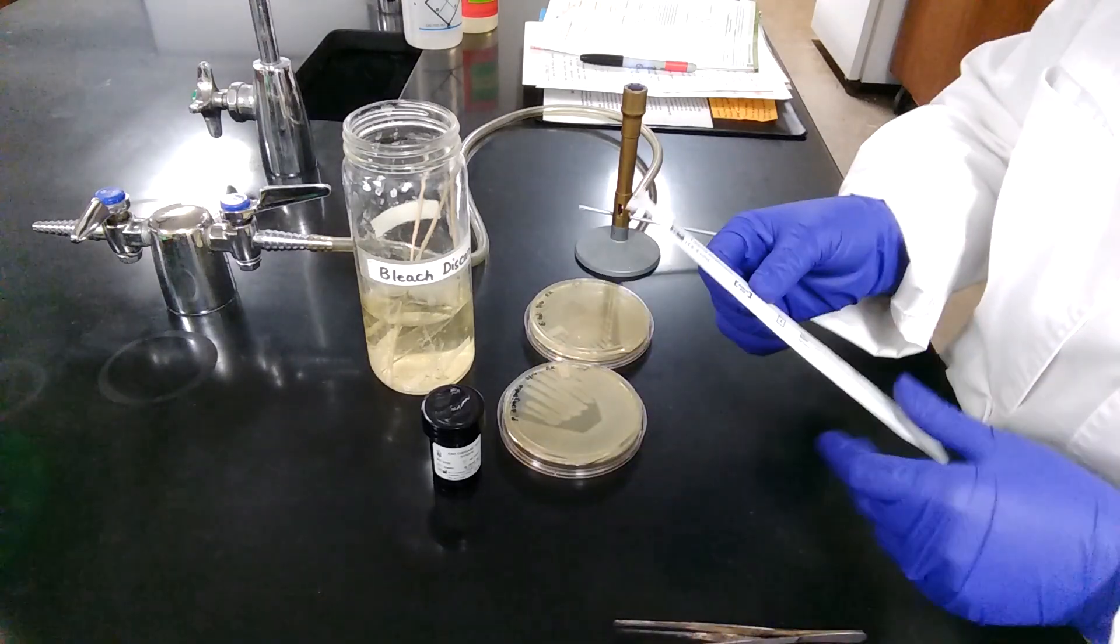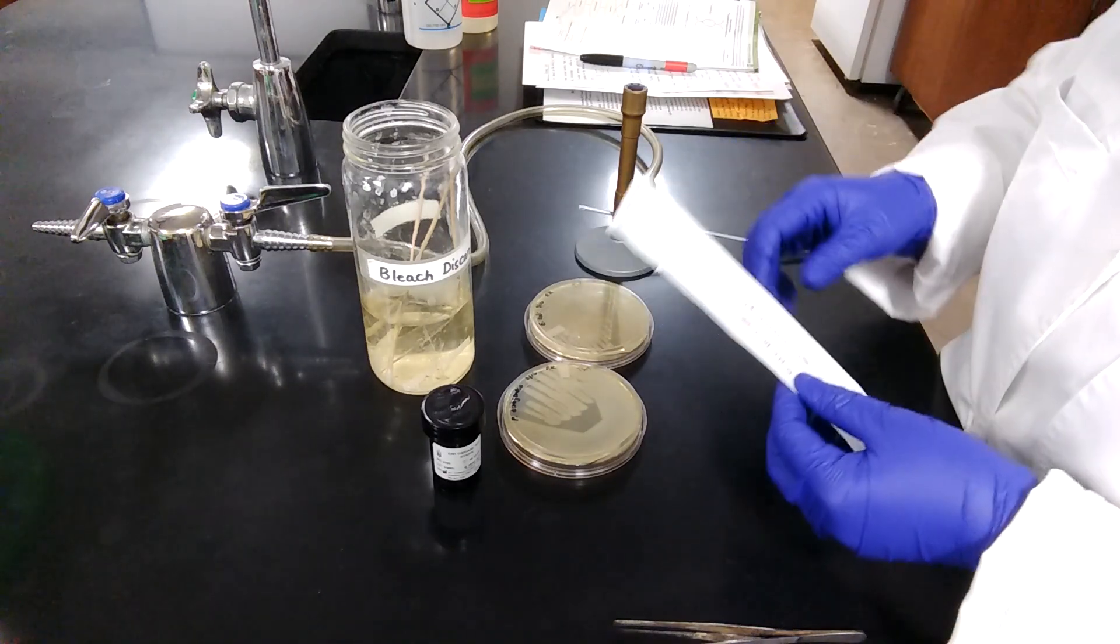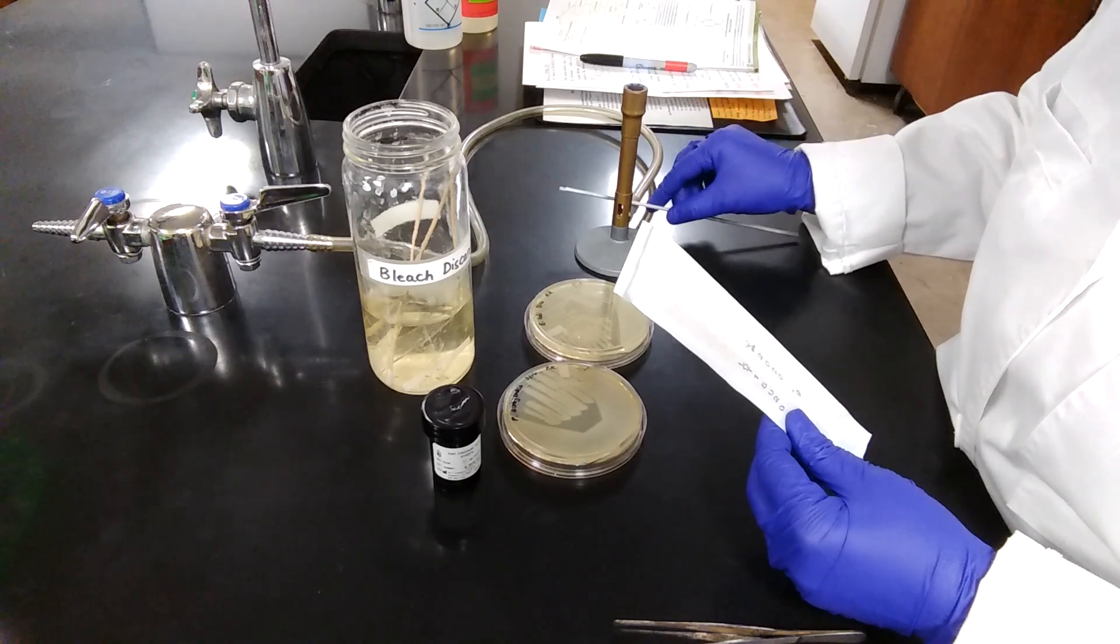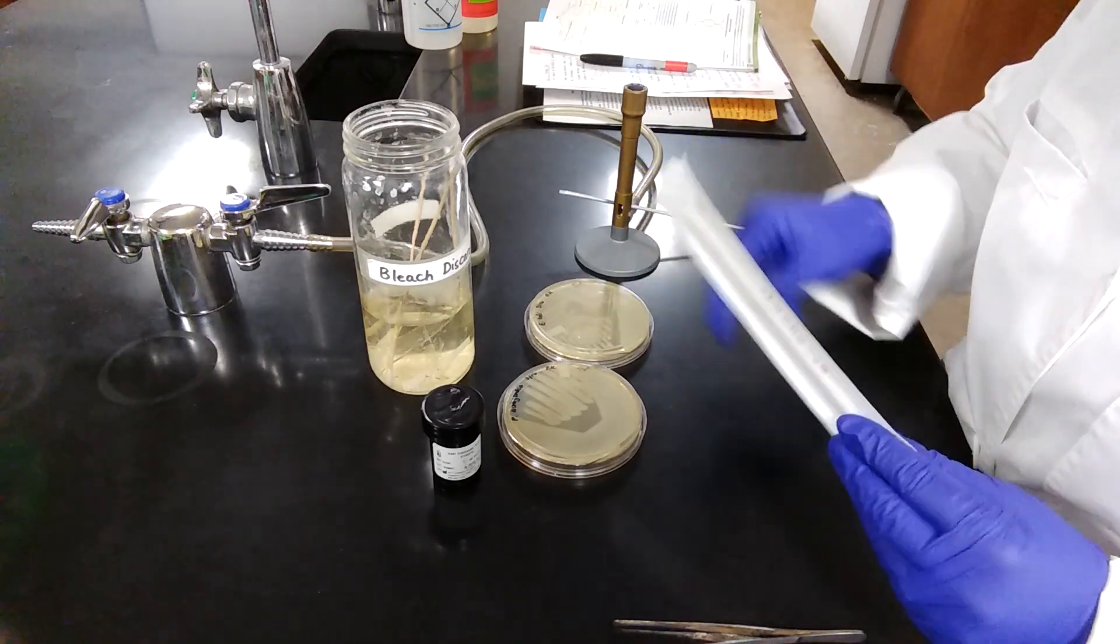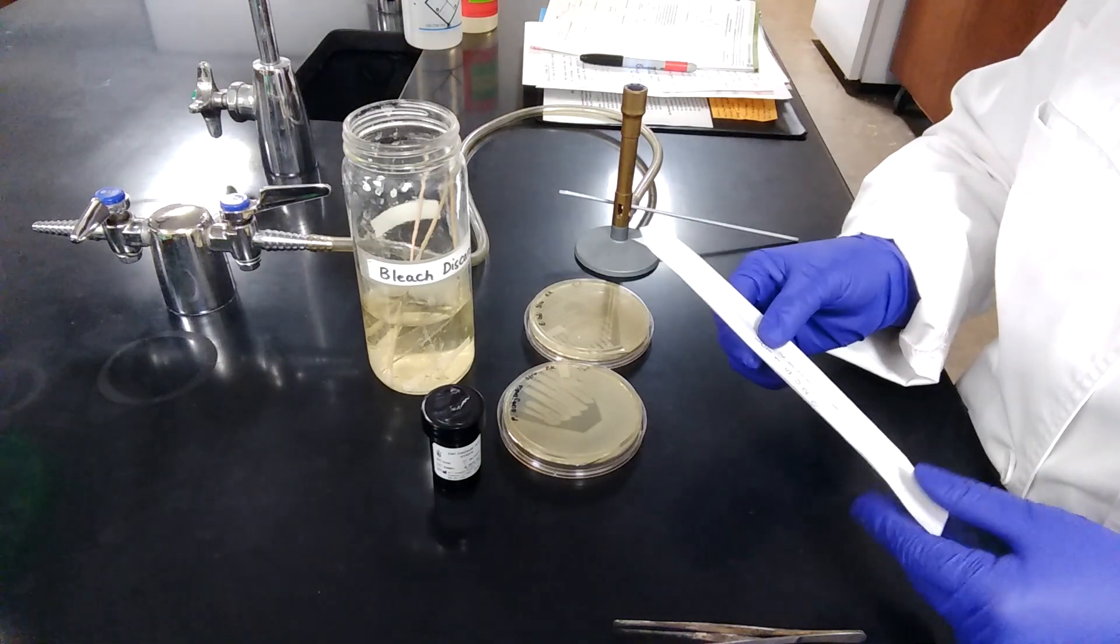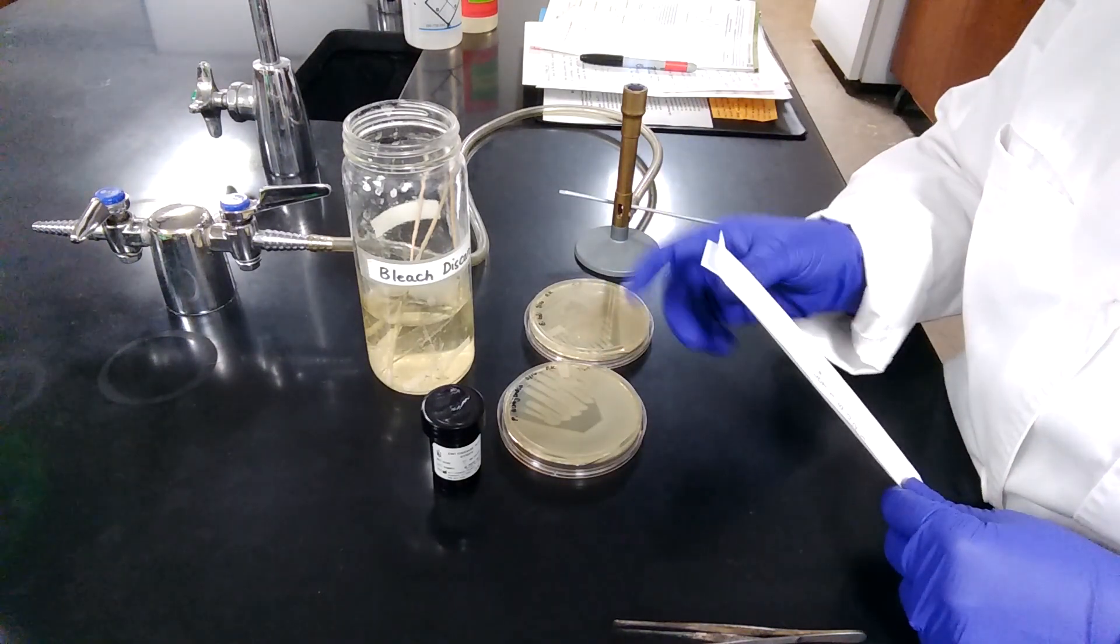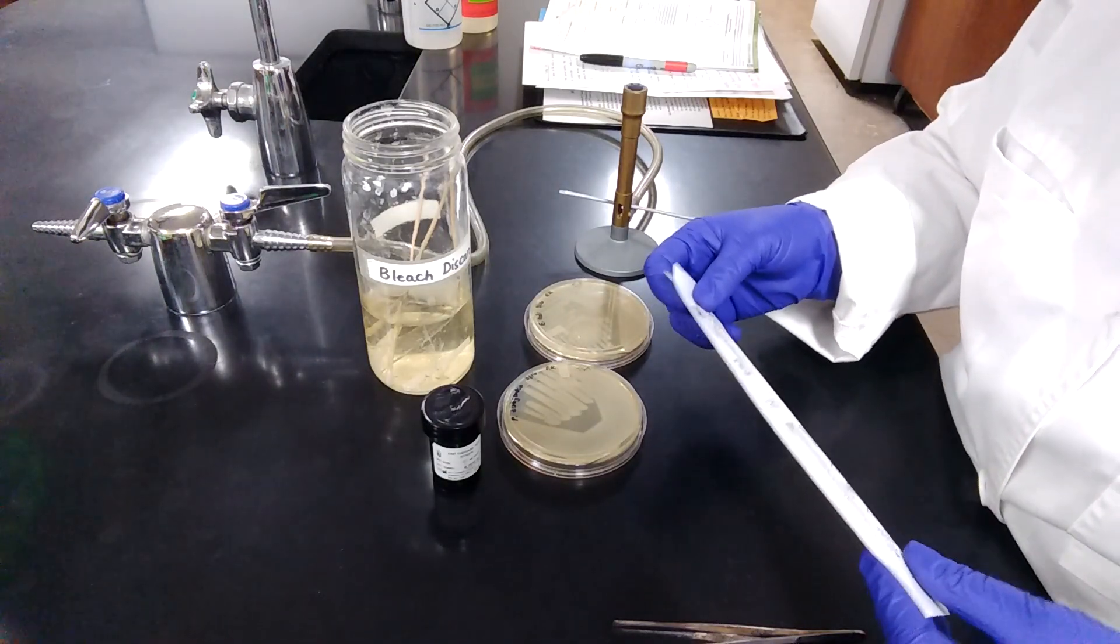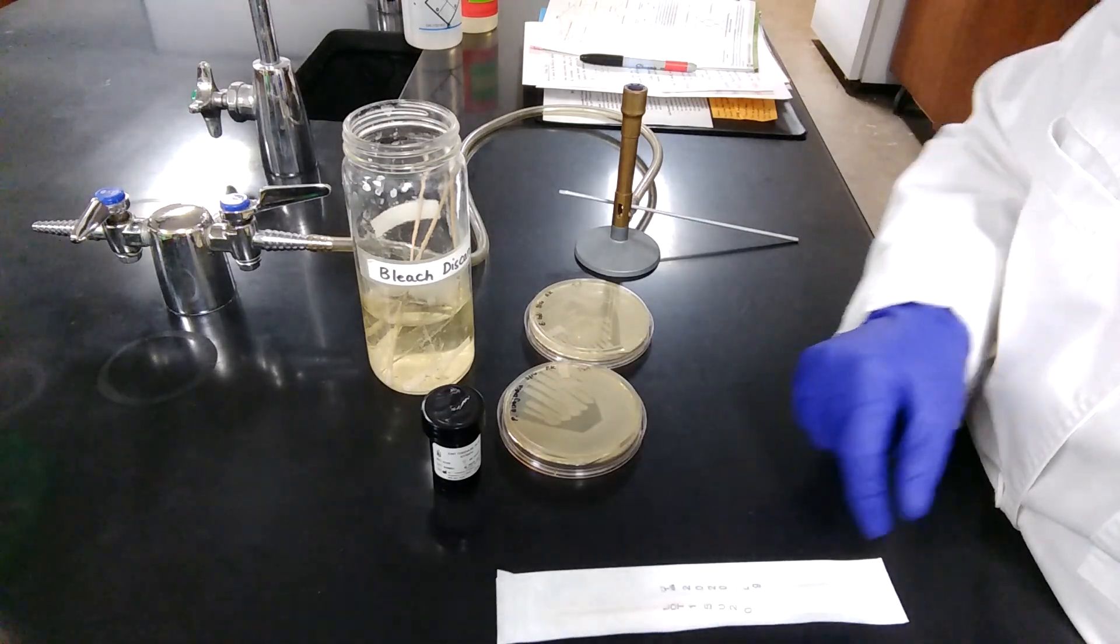We also need sterile cotton swabs to conduct this experiment. One important thing about this experiment is that you should not be using the metal inoculating loop to transfer the bacteria onto the paper strip because the metal of the loop can react with the oxidase test reagent and oxidize the reagent, giving a false positive result. So to avoid the false positive result, we are using cotton swabs to conduct the experiment.